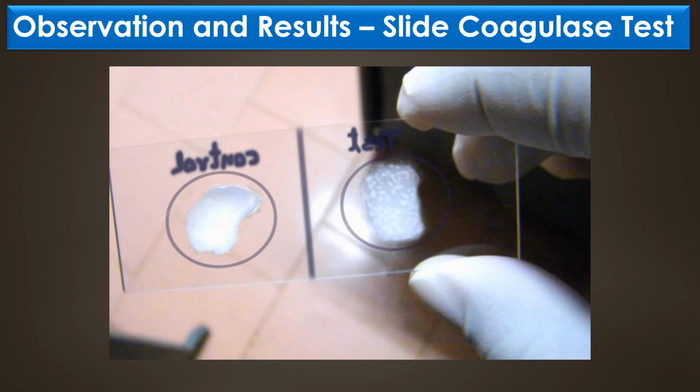Finally, observation and results of slide coagulase test. In the slide coagulase test, a positive reaction is observed by formation of macroscopic clumping in 10 seconds or less in the plasma drop and no clumping in the saline or water drop after addition of a loopful of bacterial culture. In a negative reaction, there is no clumping in either drop.